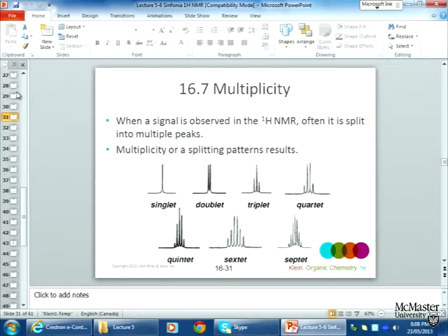In principle, you should be able to do it on nitrogen, oxygen, but for technical reasons, those are very difficult to do. So we don't necessarily gain information so much on functional groups directly as we might in infrared. In infrared, we learned that we're directly looking at whether a compound has OH bonds, carbonyl, C double bond O. Those are the two main things that we learn about.